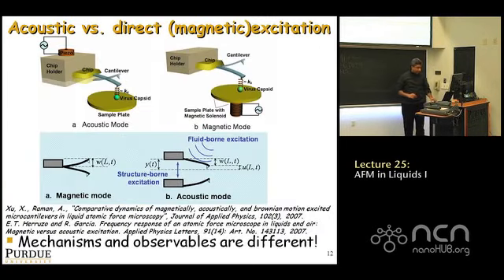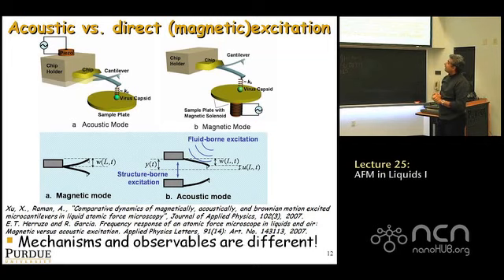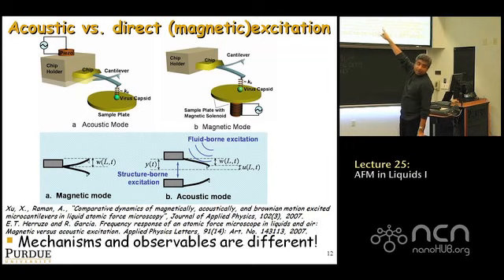Okay, now I want to talk to you about a very important thing that happens when you put a cantilever in water. And that has to do with acoustic versus direct magnetic excitation. Okay, so what you're doing when you're doing acoustic excitation or using a dither-piezo is effectively applying a piezo shaker somewhere behind the cantilever holder.